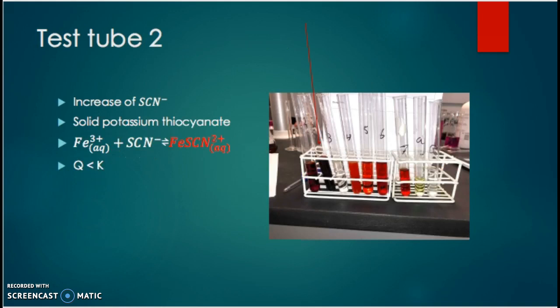In test tube two, we stressed the equilibrium by adding more thiocyanate, in the form of solid potassium thiocyanate. We again saw the solution turn darker, since the reaction is going towards the right, creating more products to reestablish the chemical equilibrium. This can be explained using the equilibrium expression, as we are dividing by a greater number, so Q is smaller than K — the same as happened in test tube one.